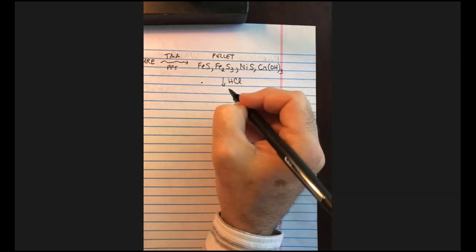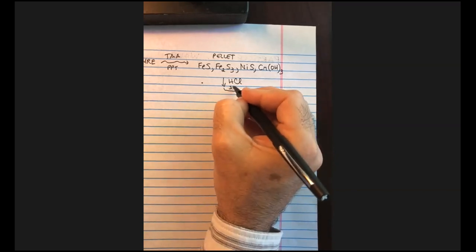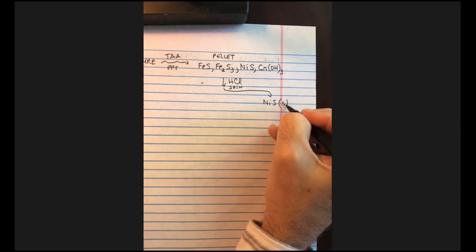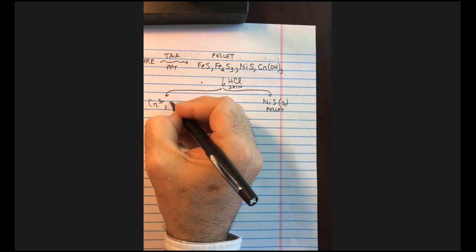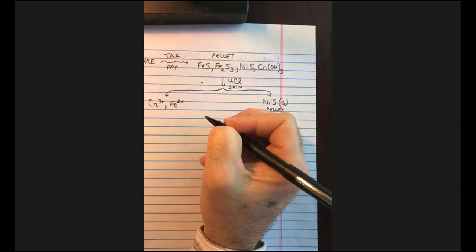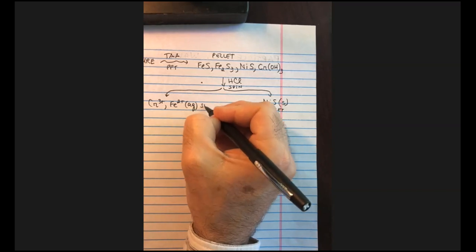So if I add HCl and spin, I'm going to end up leaving the nickel sulfide in my pellet because it does not dissolve in HCl, but our chromium and our iron ions, which at this point are going to get reduced purely to the +2 form, are going to remain in the supernate. So at this point, I've accomplished one step of the separation.